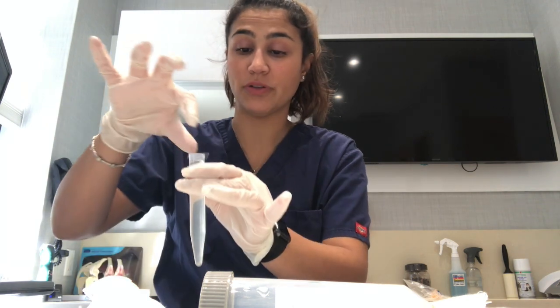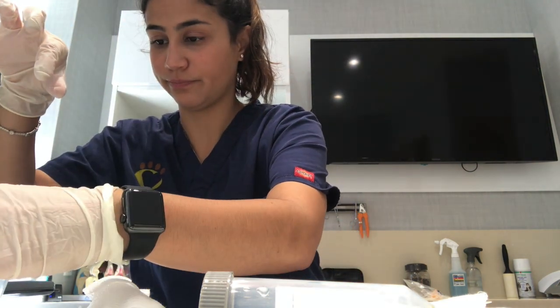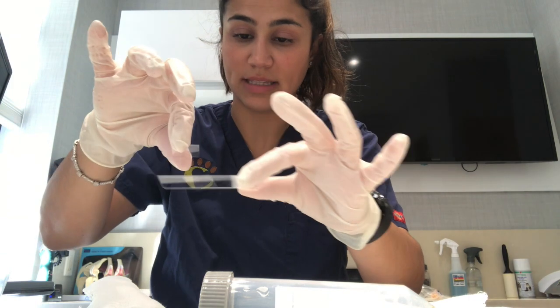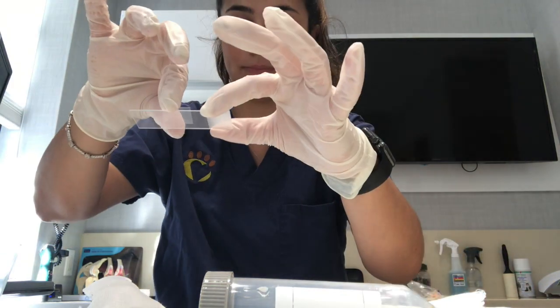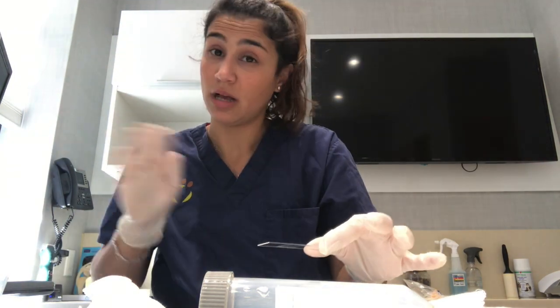Okay, so I let our sample sit for 10 to 15 minutes, and I'm going to take the cover slip off and put it on our slide, face down, so the liquid is down. And now we're ready to observe it under a microscope. This specific test is a little more sensitive than just a regular flotation. It actually does help to find more parasites.